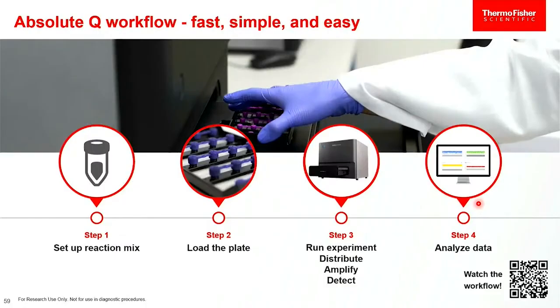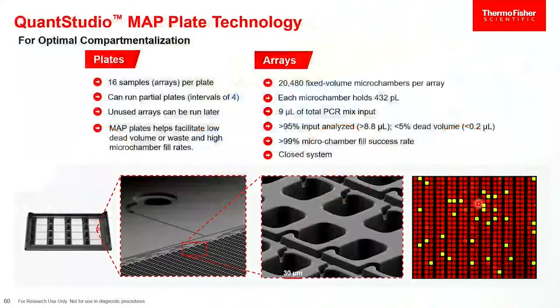Here are some images. It's a picture of the instrument and the consumables. I love this picture. You can ignore what it says at the top. This is a picture of the plate, and then we zoom in on it. Our sample goes in here, it gets pushed by the system into the channels. It then gets pushed into these individual locations. We flush it with an isolation buffer, and that allows us to do our individual reactions.